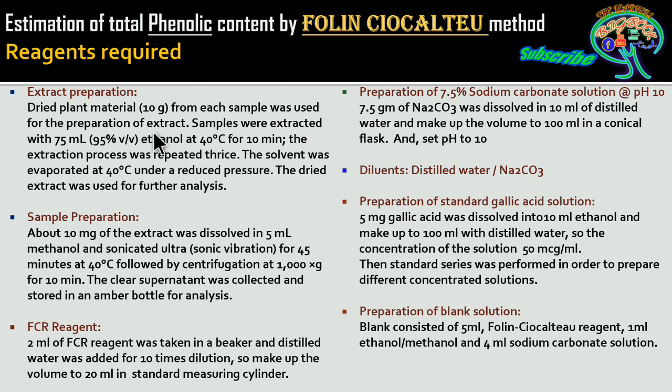Now this is how we are going to make the raw extract, where we are going to subject the material to the ethanol, and further we are going to subject the solution to 40 degrees centigrade. That is again called the heat washed extract. Heat washed extract means we have subjected the raw extract to the temperature or boiling at 40 degrees centigrade, not exceeding that.